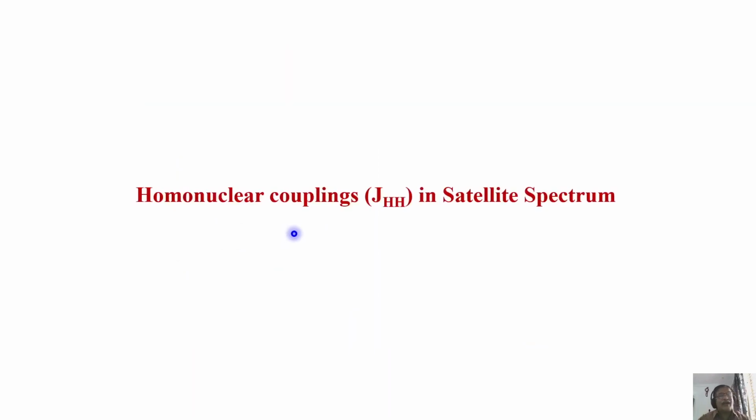Now I look for the homonuclear couplings in the satellite spectrum. Now the question is, if I analyze the satellite spectrum, what do I get?